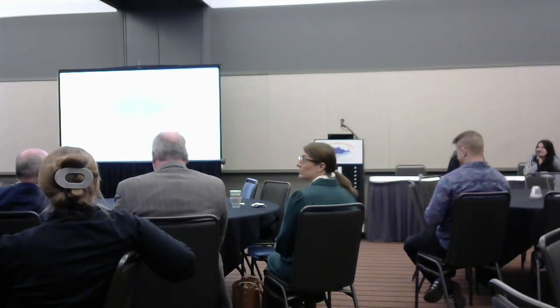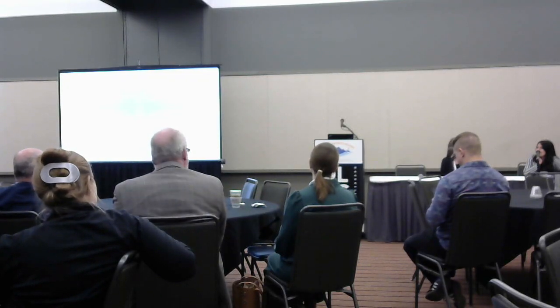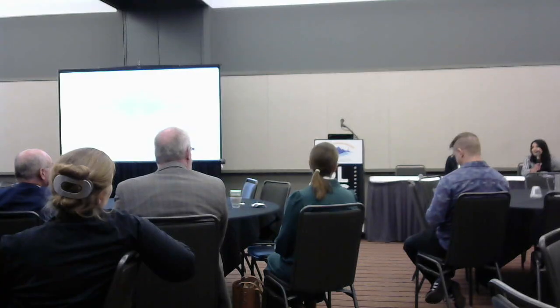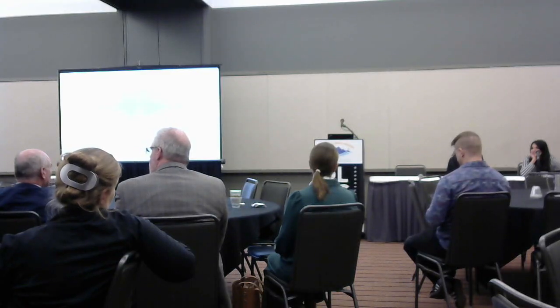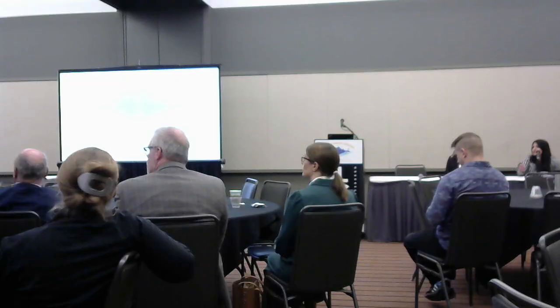Like the ImageJ macro recorder, but that would be great. I don't know of anything though. Yeah, I'm not sure. Maybe, I'm sorry, I'm putting David on the spotlight here, but I know Fiji has both a GUI as well as a headless interface, but I don't know how easy it is to translate one form to the other.